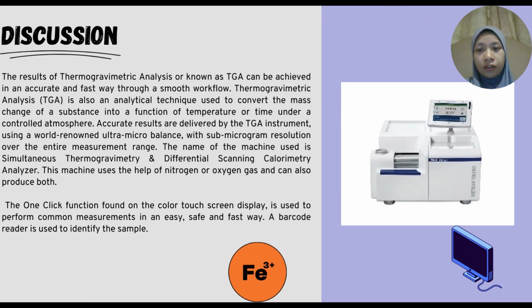Next is the discussion. The result of thermogravimetric analysis, or known as TGA, can be achieved in an accurate and fast way through a smooth workflow. TGA is an analytical technique used to convert the mass change of a substance into a function of temperature or time under a controlled atmosphere.